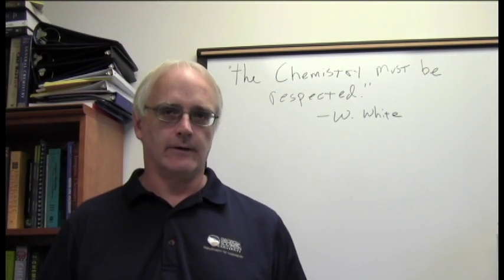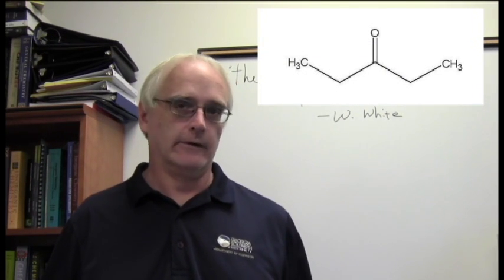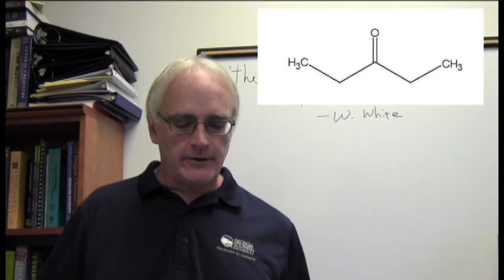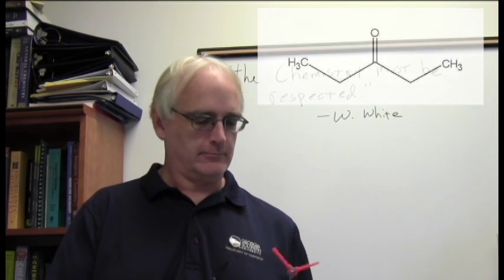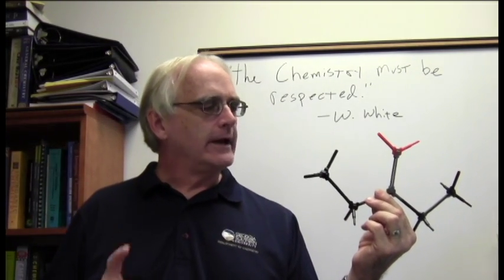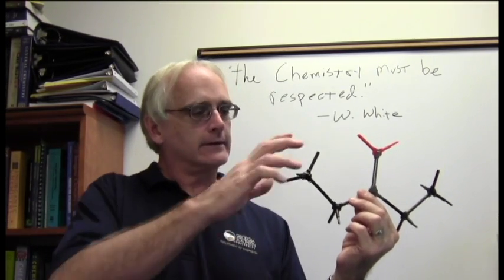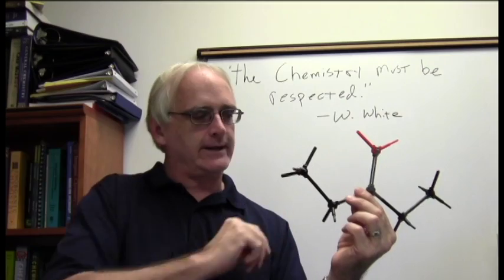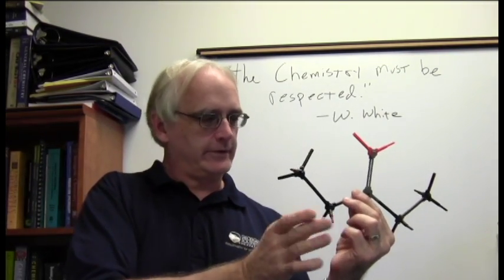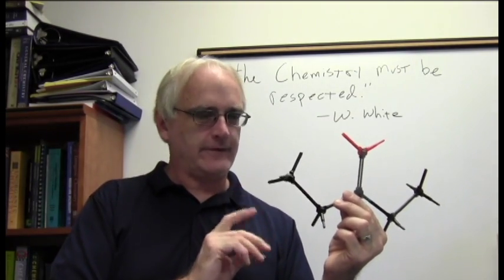It is diethyl ketone. Classic organic structure reveals that it is a larger molecule than methyl ethyl ketone. It has 10 individual protons in it. But if we look at the molecular model here, it does reveal something kind of interesting. It's a little bit different than methyl ethyl ketone. There are the 1, 2, 3, 4, 5, 6, 7, 8, 9, 10 protons in here, but they are 3 on this carbon, 2 here, 3 there. 4 distinct groups. But there's one other factor.